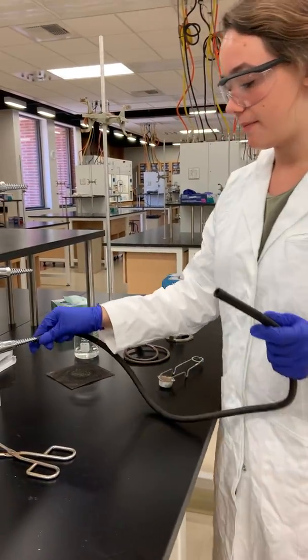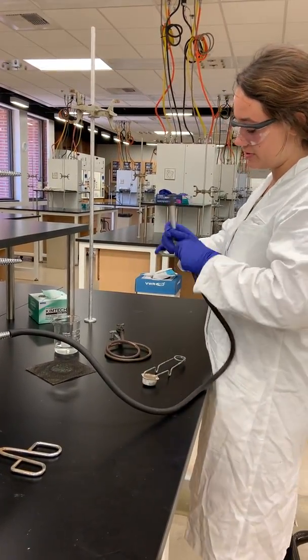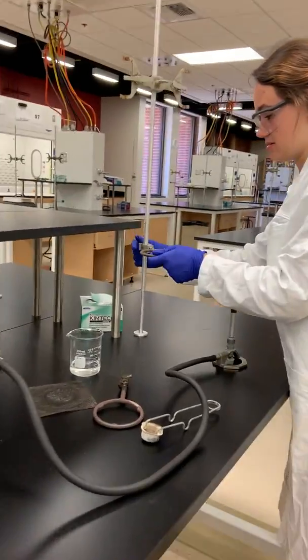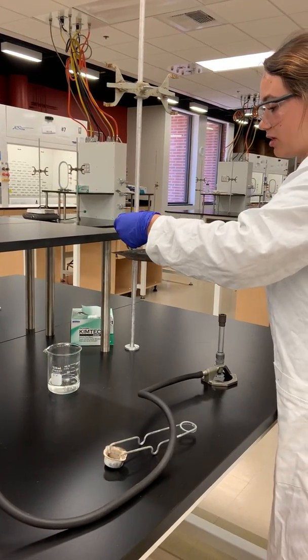First, I'm going to attach the rubber pipe to the gas and make sure it's on securely. And then I'm going to attach the other end of it to the Bunsen burner. Next I'm going to attach the ring stands, putting this on top of the large ring stand and then attaching the smaller one.